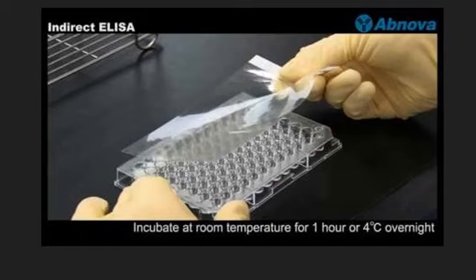So then here the incubation at room temperature and removing the solution after finishing the incubation time, and then washing again 3 times with PBS Tween 20, and the drying step. Then we add 100 microliter of the conjugated secondary antibody diluted at the optimal concentration.